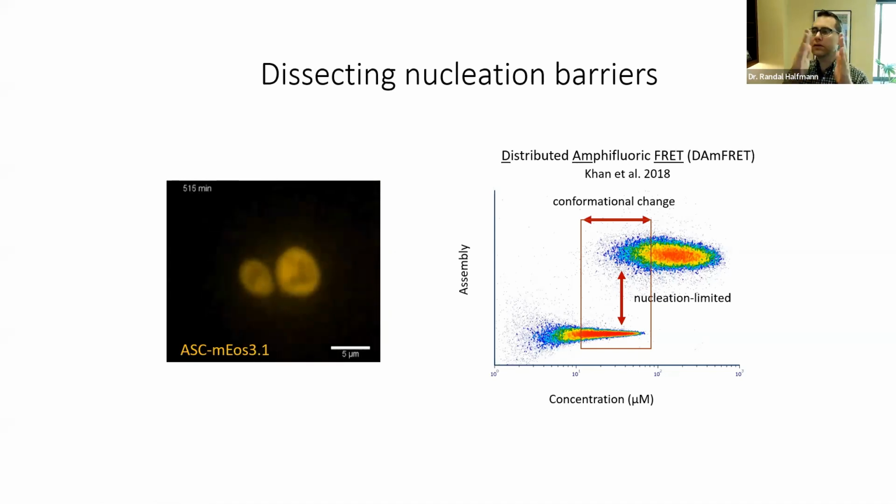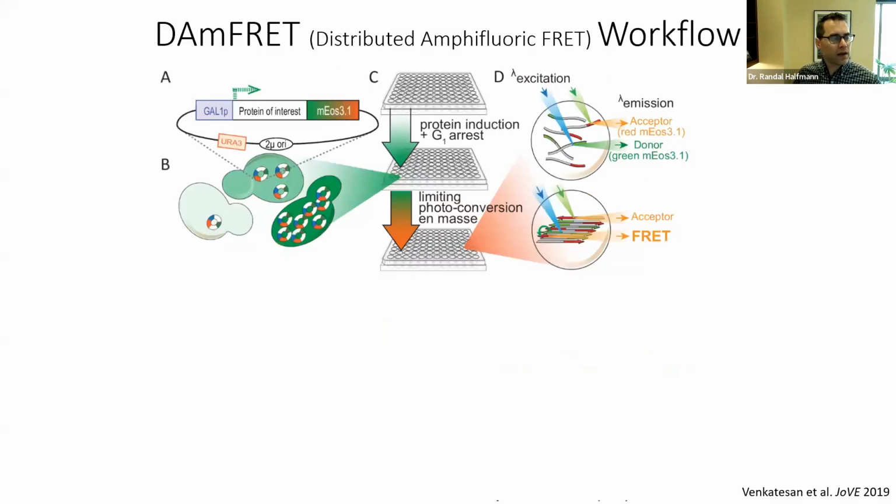And so the magnitude of that overlap actually tells us something about the magnitude of the conformational changes that are rate limiting for nucleation. So that's how we can begin to dissect what's happening at the structural level during these transitions. And there's some nuance there that if I had lots of time, I would tell you a lot more about, but feel free to ask me or Shriram in the questions.